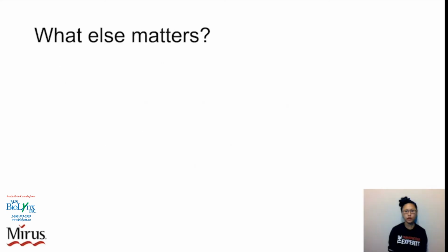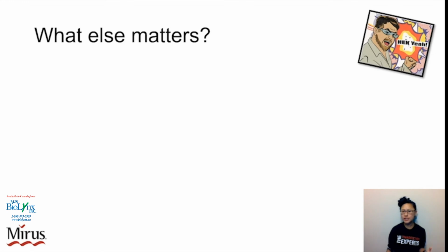Unfortunately, I did not have time today to discuss all the facets of transfection troubleshooting. However, let's quickly run through a list of questions that you can ask yourself when you're troubleshooting. What cell types are you using? Some cell types are inherently difficult to transfect via chemical transfection. In those cases, you might want to consider an alternative method like electroporation or transduction with virus.